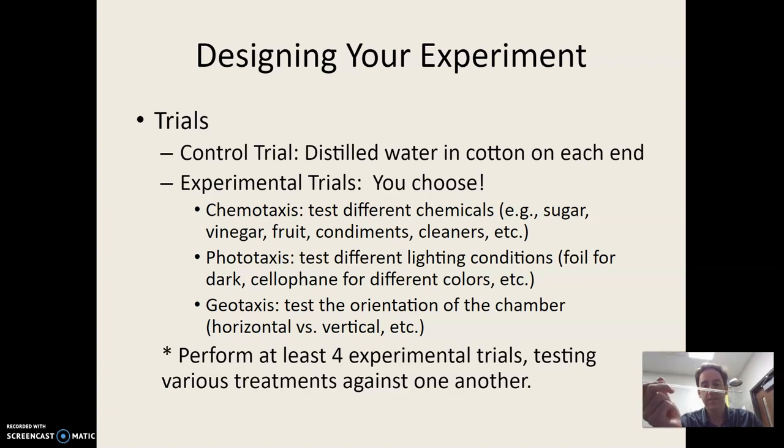Phototaxis, you could look at different lighting conditions. So maybe you create a dark side and a light side and see if that has any impact, or a red side and a blue side using transparent cellophane, which is essentially colored Saran wrap.